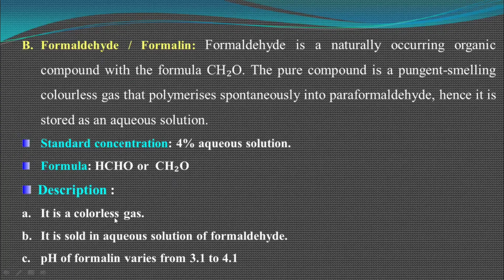The properties of formaldehyde: it is a colorless gas. It is sold in aqueous solution as formalin. The pH of formalin varies from 3.1 to 4.1.